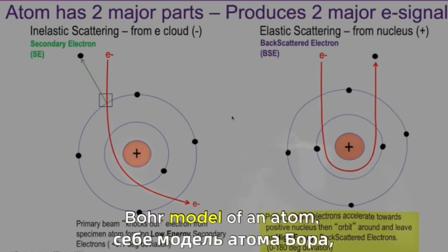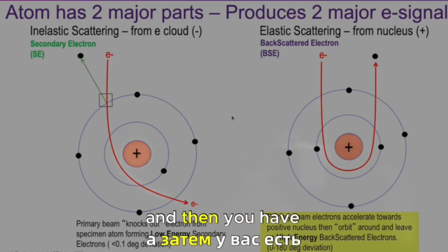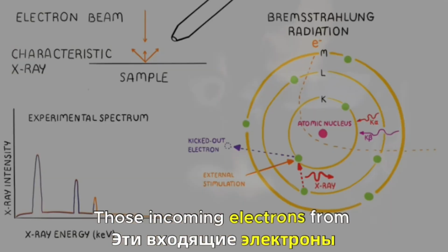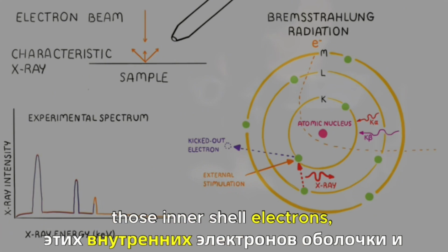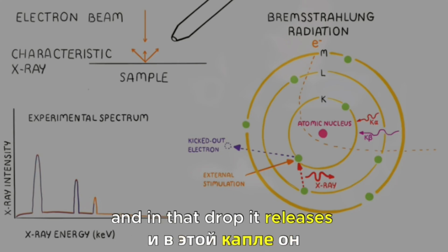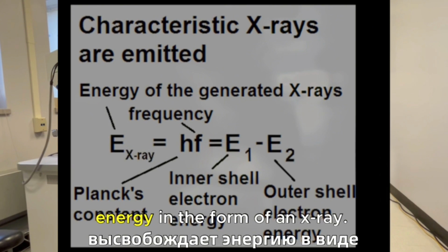So if you imagine your Bohr model of an atom, you have a nucleus, and then you have essentially rings of electron orbitals. Those incoming electrons from a beam can come down, displace one of those inner shell electrons, and cause instability in the atom. An outer shell electron will have to drop in to fill that void, and in that drop, it releases energy in the form of an X-ray.